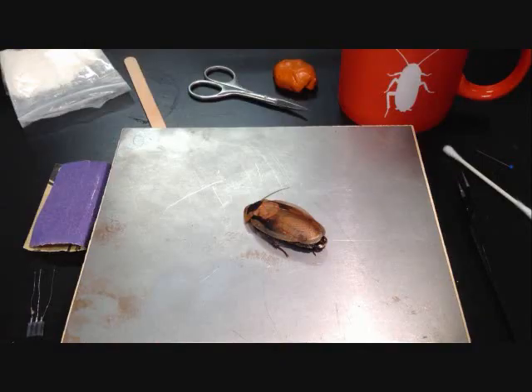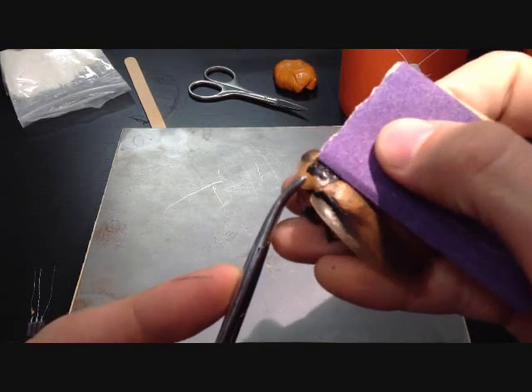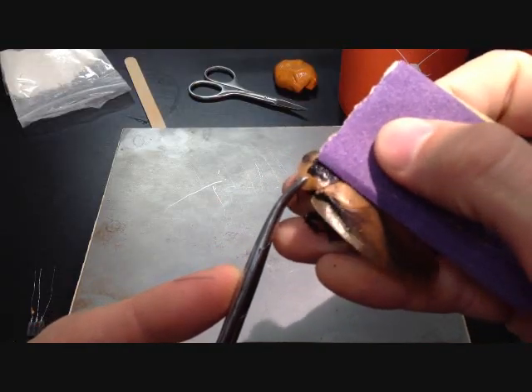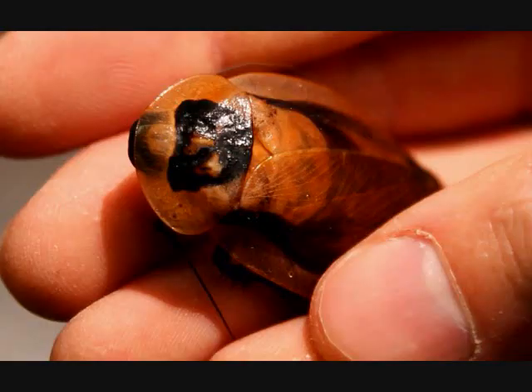Cockroaches have a waxy exoskeleton made of chitin, which makes it very hard for the superglue to stick. So with sandpaper, lightly sand the center of the pronotum to roughen the waxy chitin. The pronotum is their exoskeleton hood with the big black dot on it. Be careful not to push too hard when sanding — hemostat forceps are handy here to grasp the pronotum. This is similar to sanding the tops of your fingernails: it's a hard substance without nerves. Sand until the area feels slightly rough to the touch; this will allow the superglue to stick securely. Here is a picture of what it will look like when you are done.